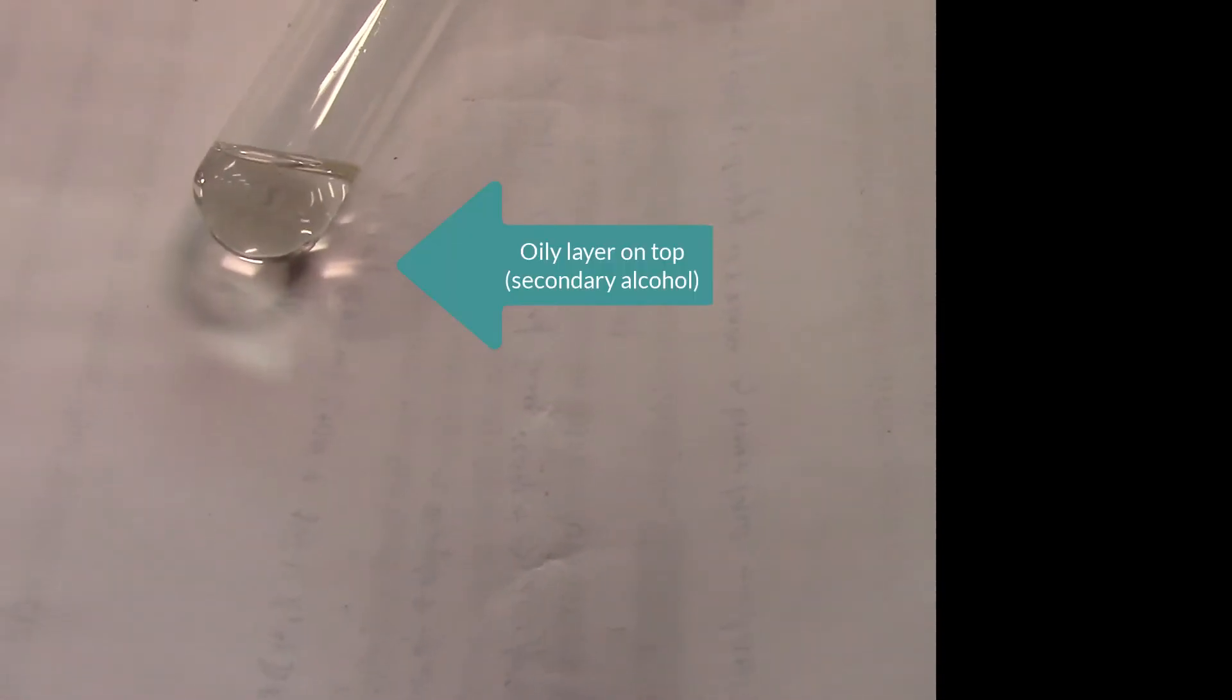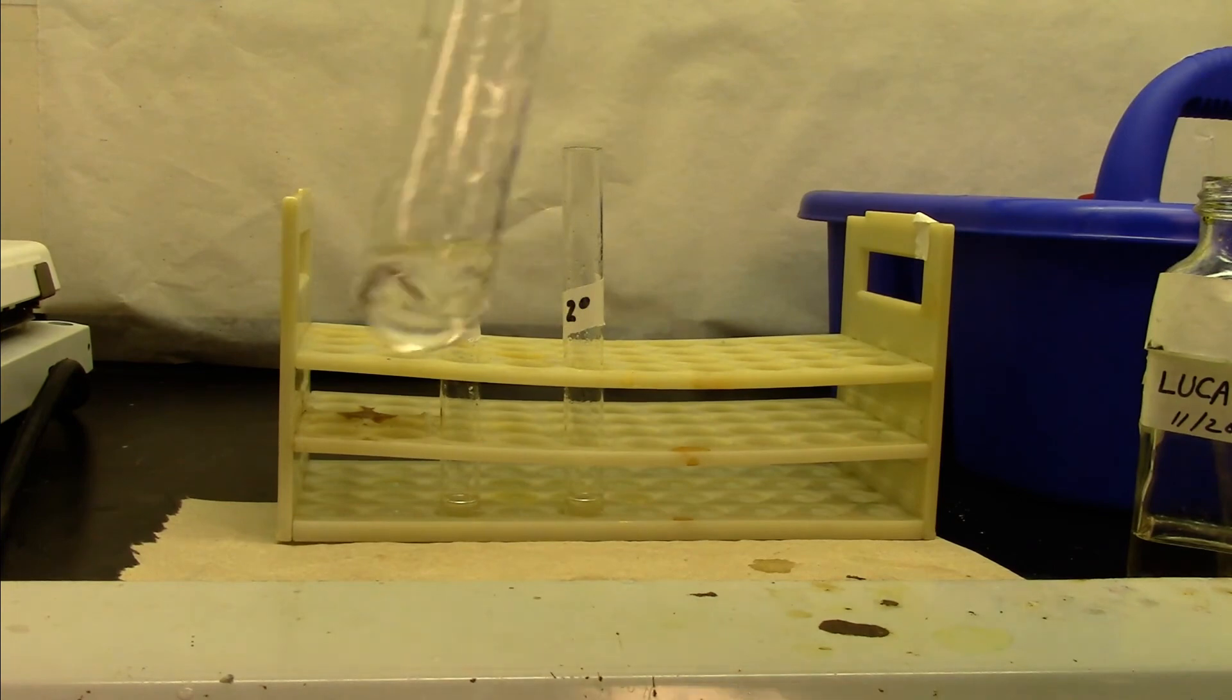It does have an oily layer. This is the secondary. It's been about a few minutes. When you give it a mix, it forms an oily layer on the glass wall. The primary has no reaction.